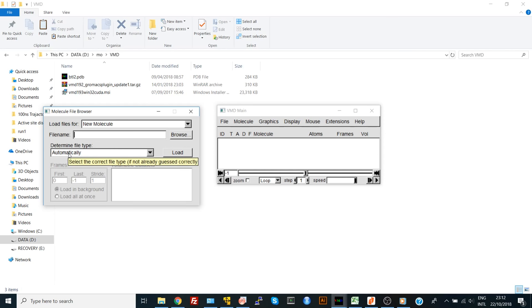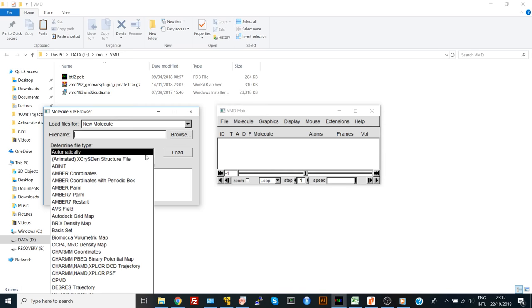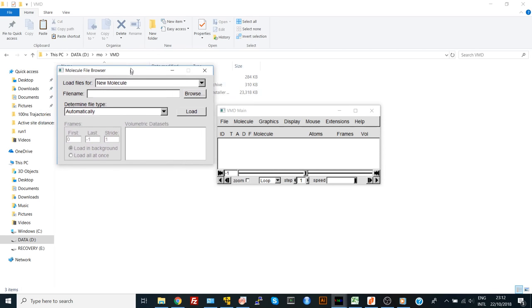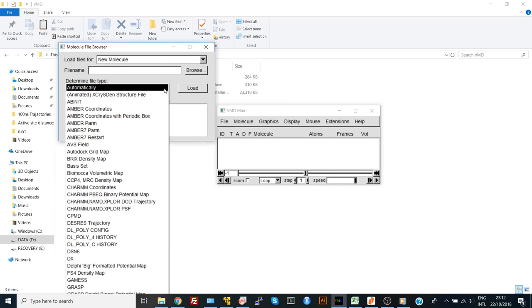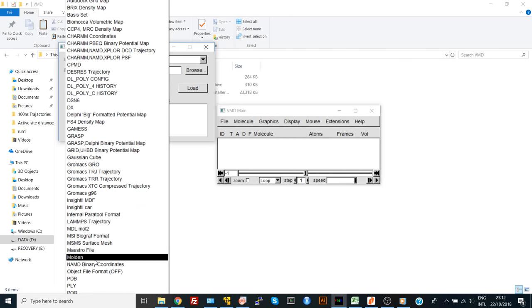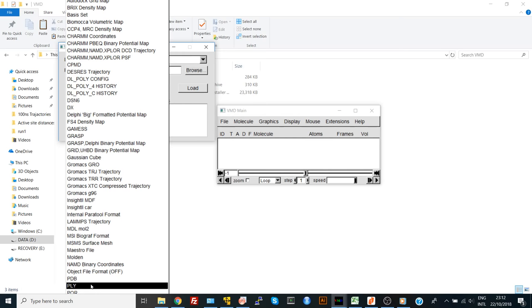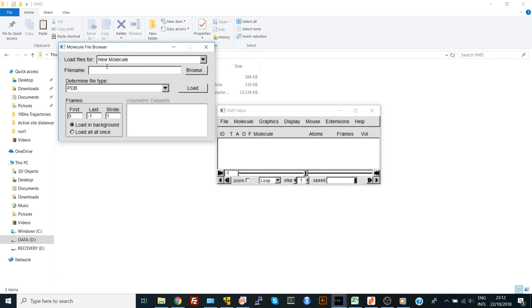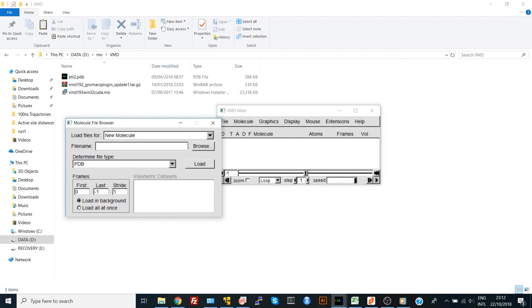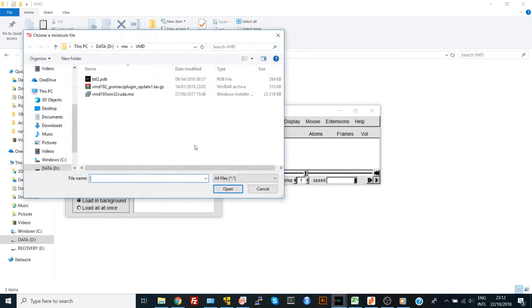Our file is PDB, so we will go to different file types and find PDB to tell VMD that we are loading a protein data bank or protein PDB structure. Here, say browse and choose your protein.